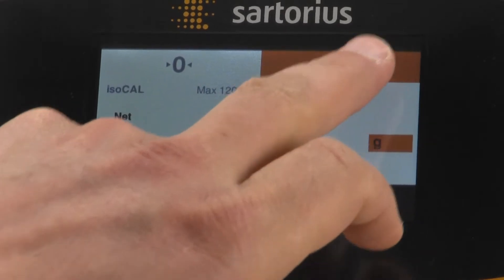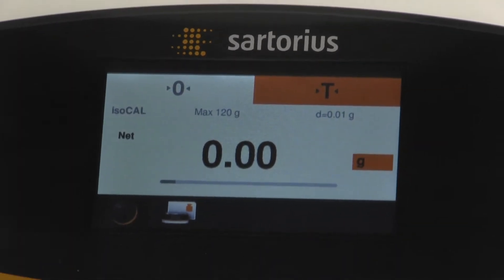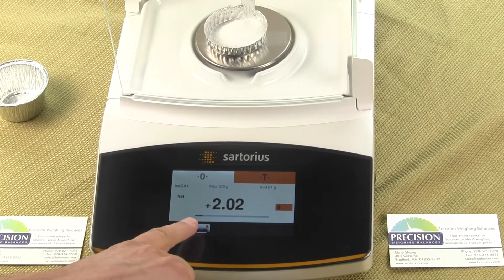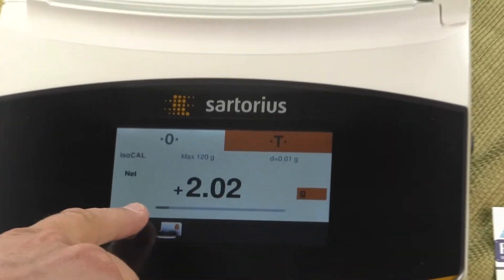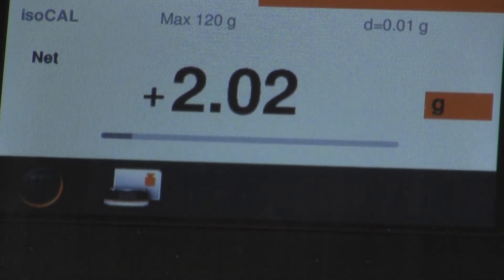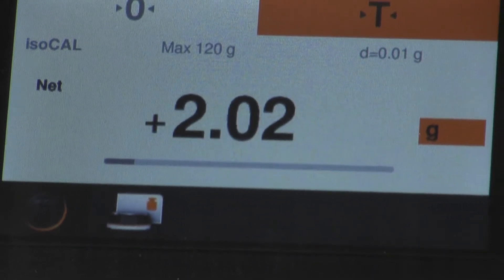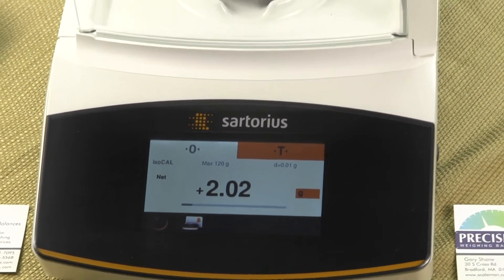Another thing I wanted to show you: we can tare the balance to the full capacity of the balance. As we add more sample to our disposable aluminum pan, you can see at the very bottom of the display, underneath the weight reading, there is a weigh meter showing you how much of the capacity of the balance you've used. If I put my hand on the platform, you will see this meter increase. This helps you have a visual idea of how much weighing capacity you've used so that you do not overload the balance.